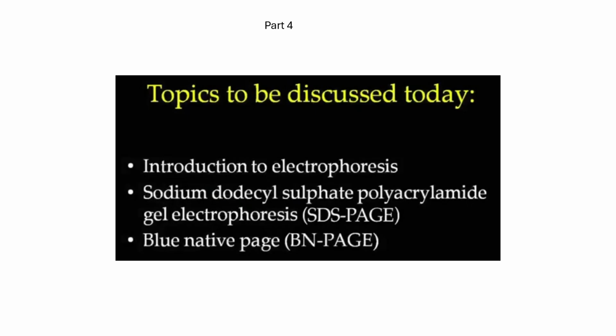In terms of gel-based proteomics, one of the techniques is electrophoresis. For proteins, you can use either native PAGE or SDS-PAGE. Depending on whether you have a complex protein and you need to know whether those complexes are being formed or not, you can use native PAGE.